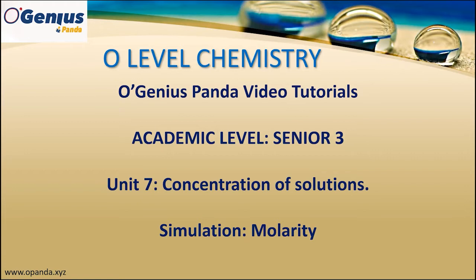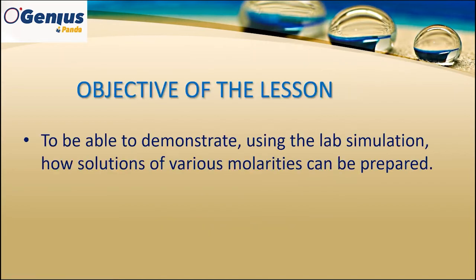And today we will explain how different solutions, having different molarities, can be prepared using the simulation we have on the platform, www.opanda.xyz. Here we have the objective of the lesson. We should be able to demonstrate using a lab simulation how various solutions having various molarities can be prepared.